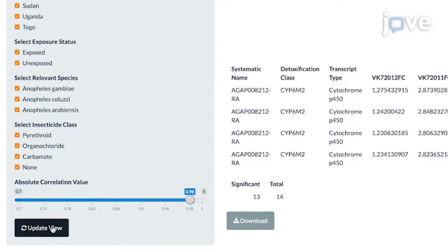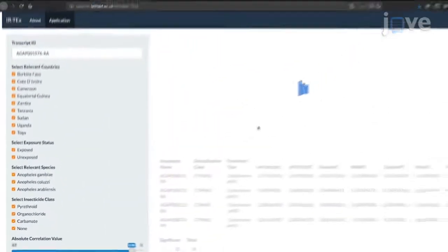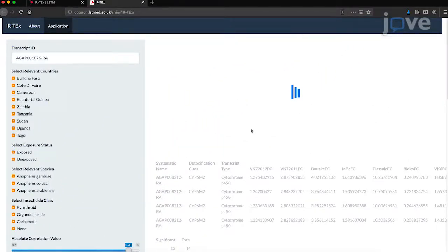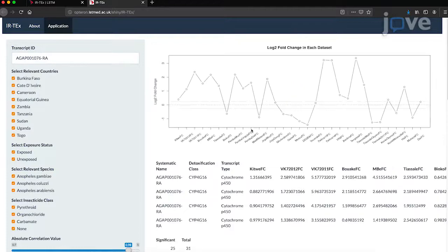Click Update View at the bottom of the selection menu or press Return, ignoring absolute correlation value for now. Give the application time to update.